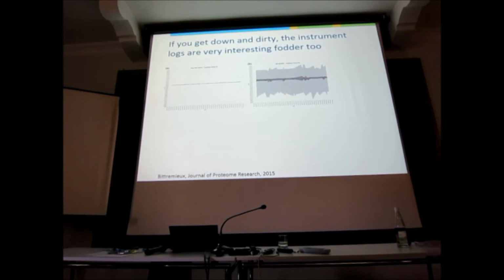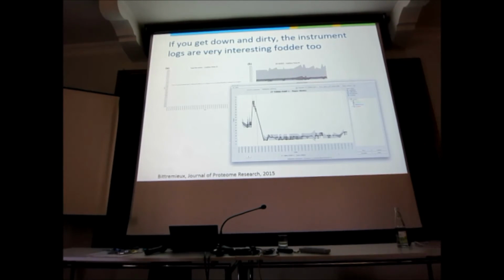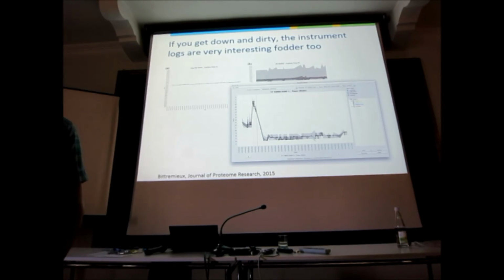Yeah? Speaking of sounding the alarm, this is the watts power consumption of turbopump 4. You see this yellow line? This yellow line says, I heard a strange noise from the instrument. It's really true, this is actual data, right, from our collaborators in Mol. And this tool that we built, that is freely available, you can annotate your data. So you see here, there is an event, but it's yellow, so you can't read it. So there's a strange event. You know what this red line is? The turbo pump ate itself.